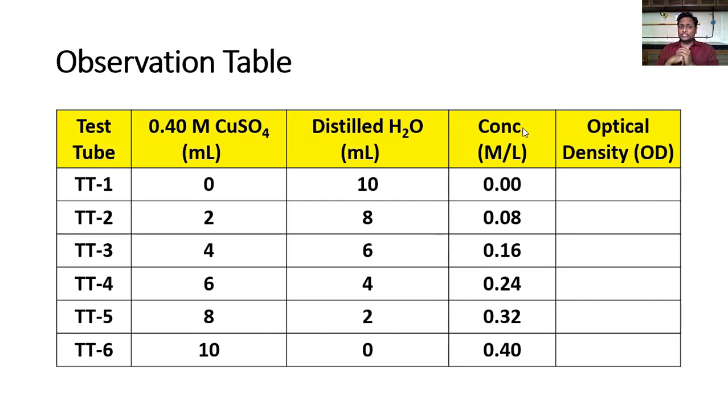In the first, which we are labeling as blank TT1, you see there is no copper sulfate added, we are taking 10 ml of distilled water. TT6 which will be purely stock solution, we are taking 10 ml of that and no distilled water is being added. TT2, you see 2 ml of copper sulfate, 8 ml of distilled water. TT3 is 4 ml of copper sulfate and 6 ml of distilled water. In the same fashion, we have tried to keep the total volume as 10 and we are increasing copper sulfate stock solution.